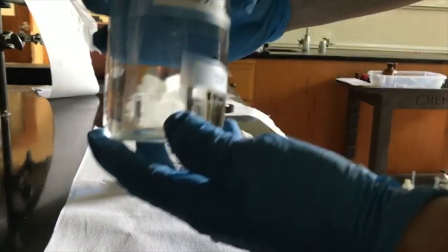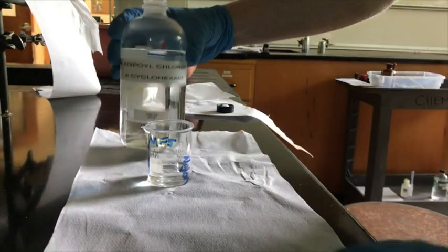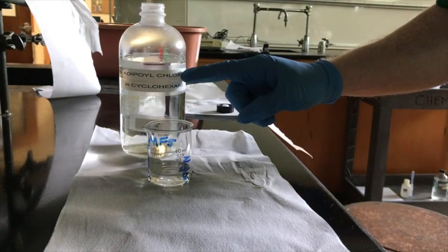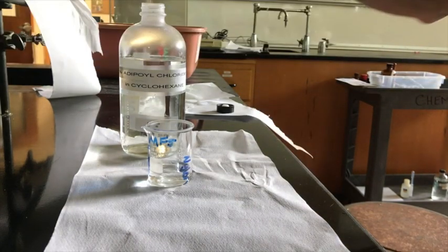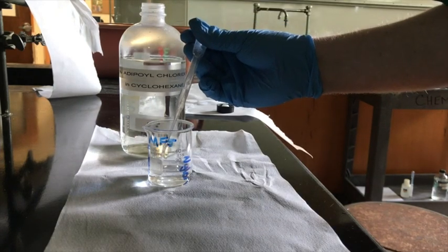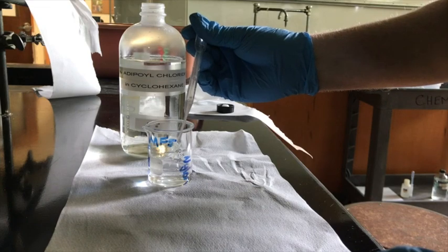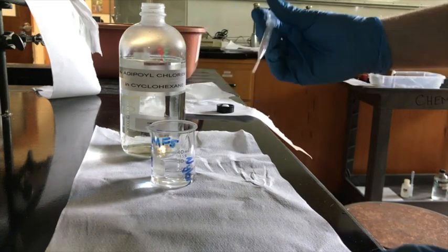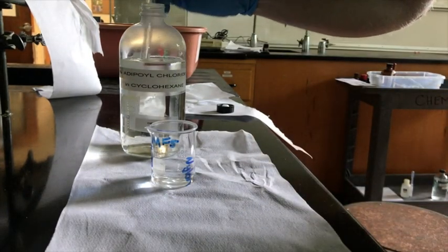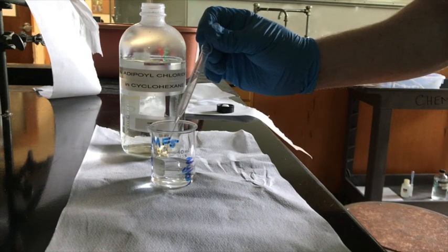Next up, I'll add the 5% adipoyl chloride in cyclohexane. This is the diacid chloride, 6 carbons with acid chlorides on the ends. It's in cyclohexane, which is less dense than the aqueous amine. So I'm going to try to slowly add this and not let the layers mix. I'll pipette some down the side. Am I doing a good job? I'm doing an okay job. The first little bit of the cyclohexane diacid chloride is forming a polymer of nylon, a little blanket over the aqueous amine, so that's preventing them from reacting too much.